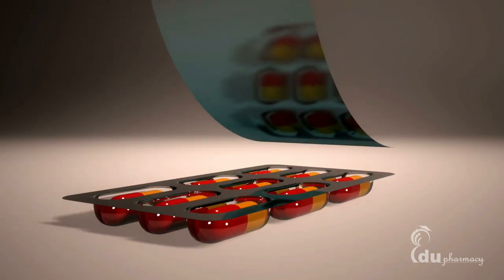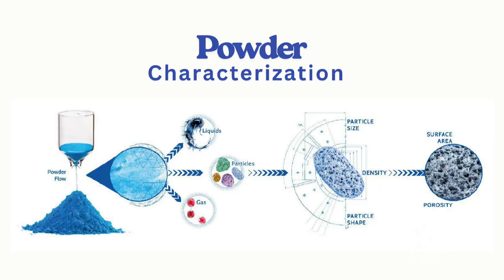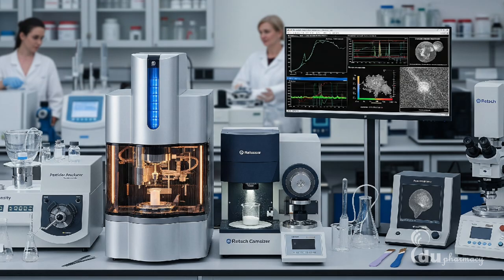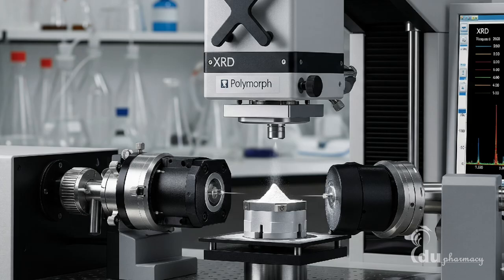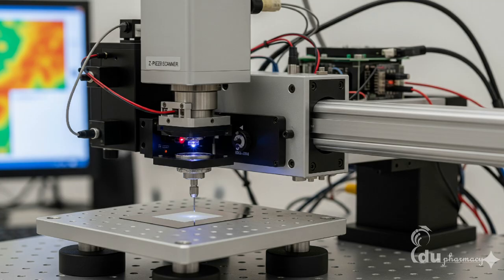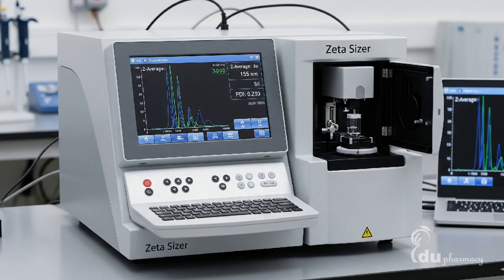In short, powder characterization is not just about lab tests. It directly affects patient outcomes. Looking at the future, modern technologies are transforming this field. X-ray diffraction, or XRD, is used to detect different crystalline forms known as polymorphs, which can drastically change solubility. Atomic force microscopy gives us nanoscale surface details, and real-time particle analyzers provide continuous monitoring during manufacturing.